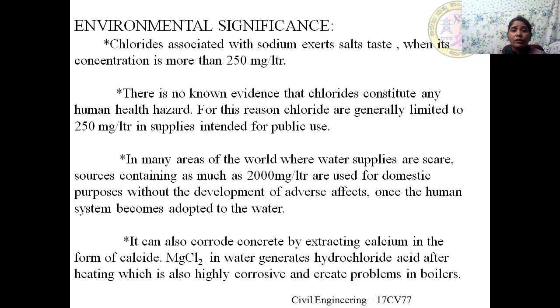And one more important point: when chloride is present at a concentration of more than 250 mg per liter, it is usually associated with sodium and exerts a salty taste. So once the salty taste appears, we can say sodium chloride is in excess.